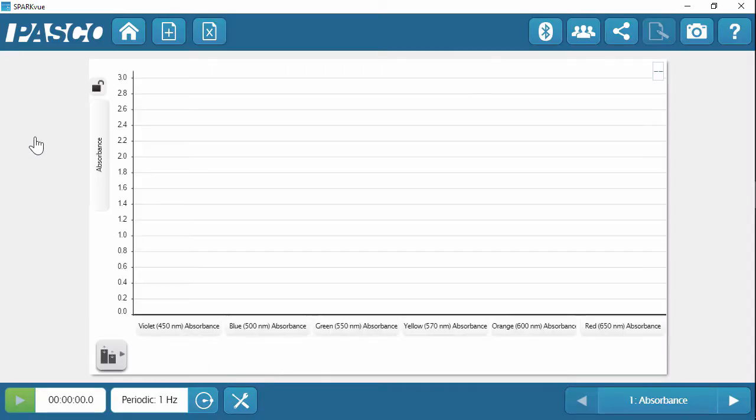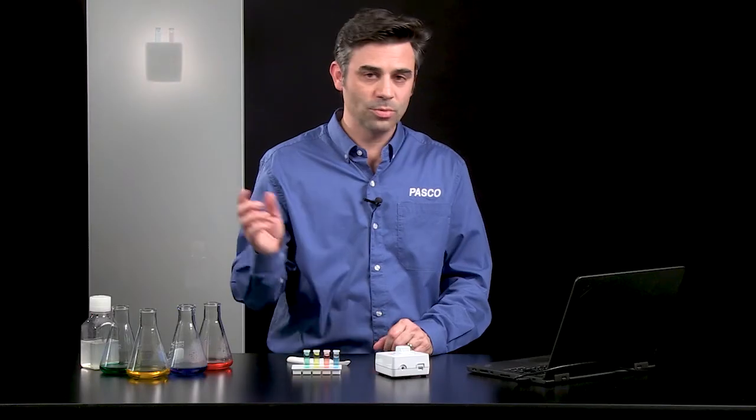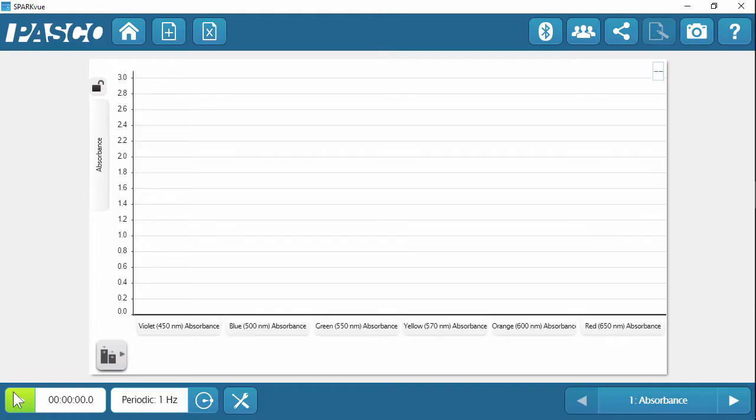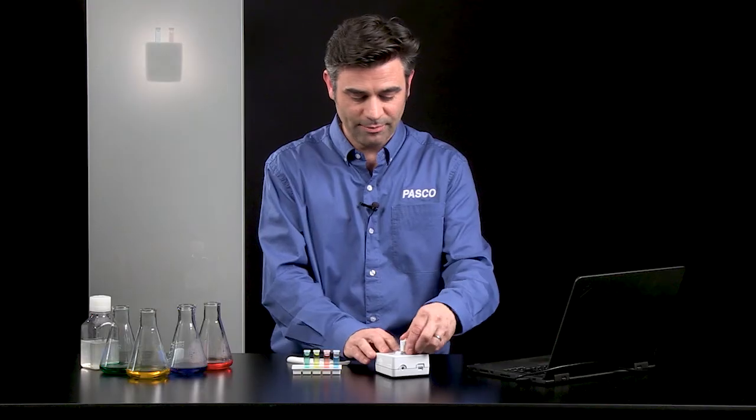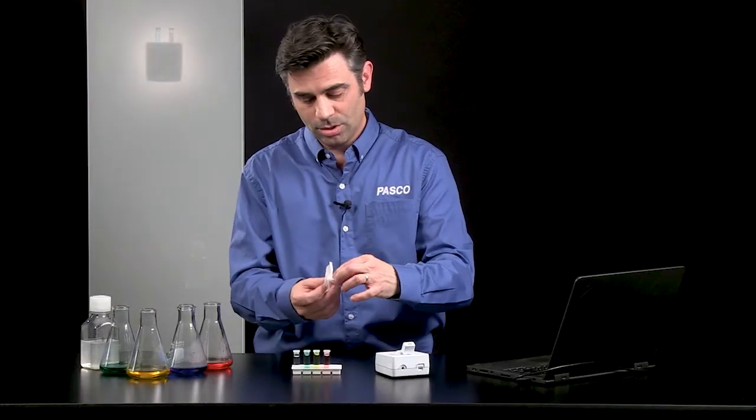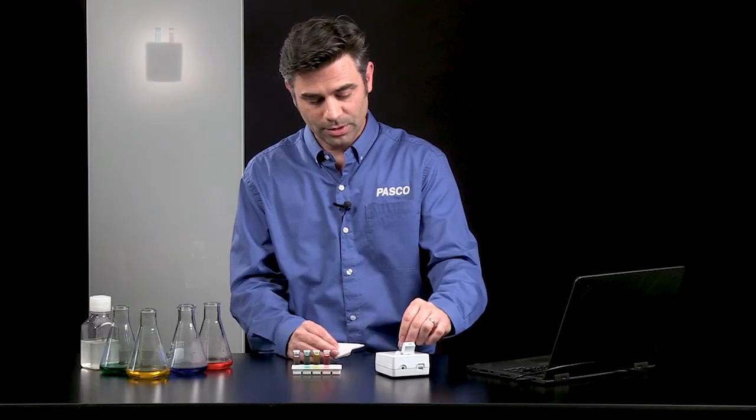If I click on that, then a page pops up. It's a bar meter display where my absorbances of the different wavelengths are across the bottom and the absorbance value is on the y-axis. And those absorbance values on the bottom are in increasing wavelength order. So if I hit start, I see pretty much nothing, nice and zero across because I have my blank in there. But now we can test some colored solutions. And you do want to make sure that you're wiping those cuvettes in between and you pop them in.